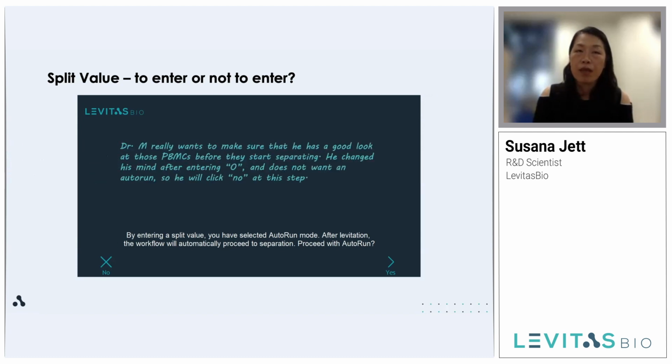Dr. M really wants to make sure he gets a good look at those PBMCs before they start separating. He changed his mind after entering 0 and does not want to auto run. So he will click no at this step.